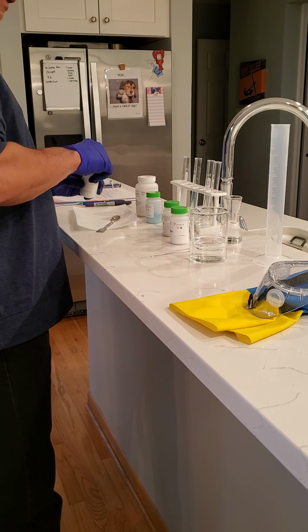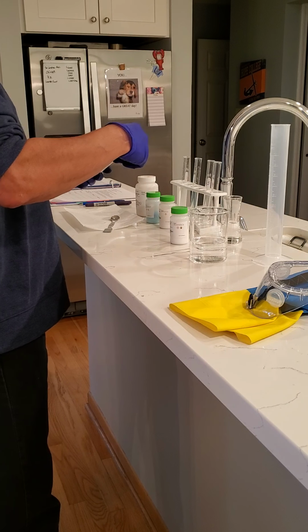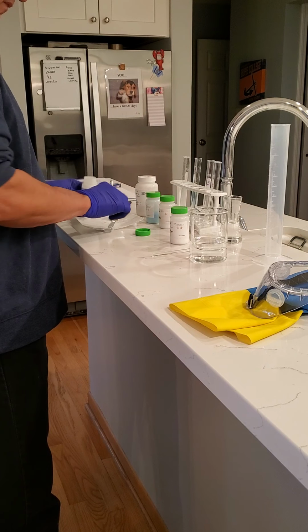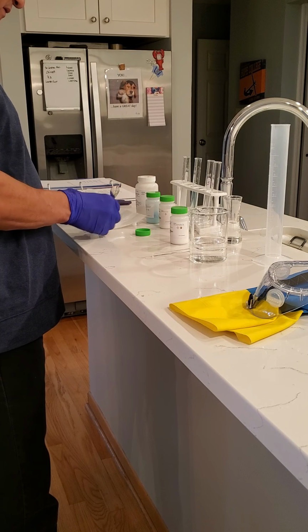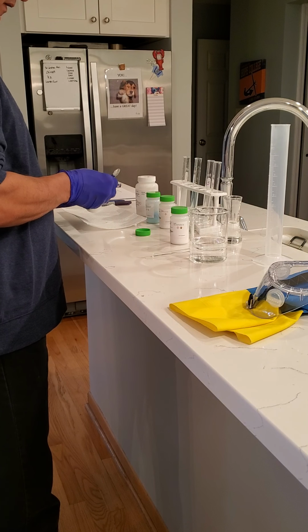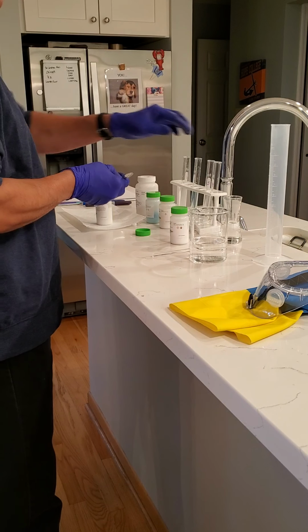That's number 3. Number 4 is the potassium bitartrate. This looks like a very powdery solid as well, so let's take our flat end of the spoon. It'll be easier to put in the test tube.